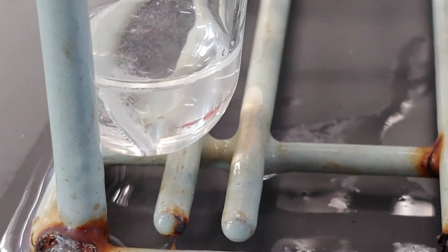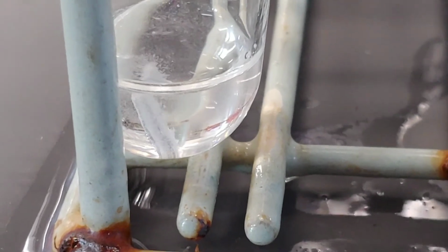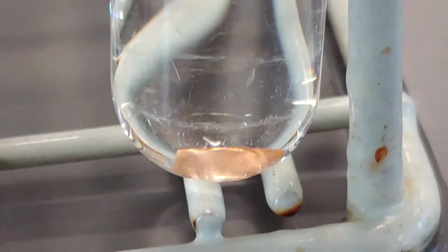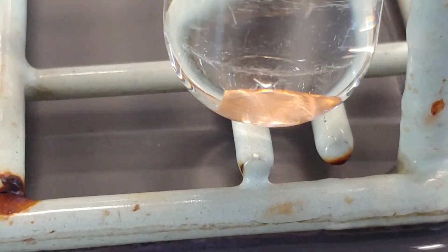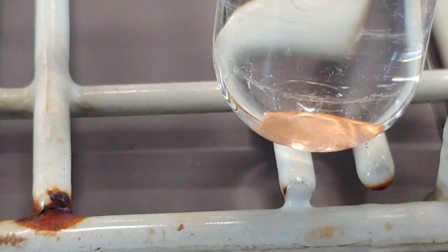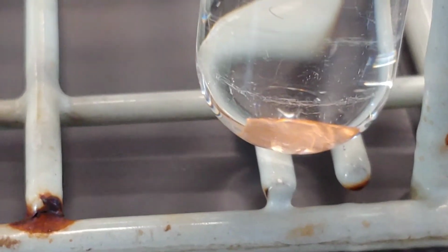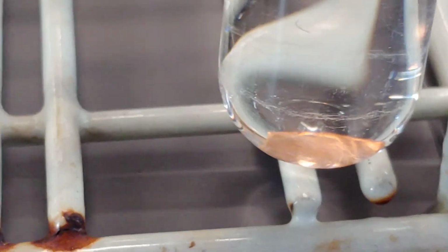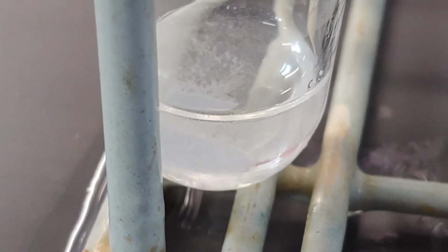Okay, I told you earlier that we were going to come back to reaction number 7, the copper metal plus the aqueous zinc nitrate, and there it is. And from my perspective, sitting on this side of the camera, it looks no different. Looks the same. Go back to now reaction number 13, magnesium metal plus acetic acid. Still getting bubbles.